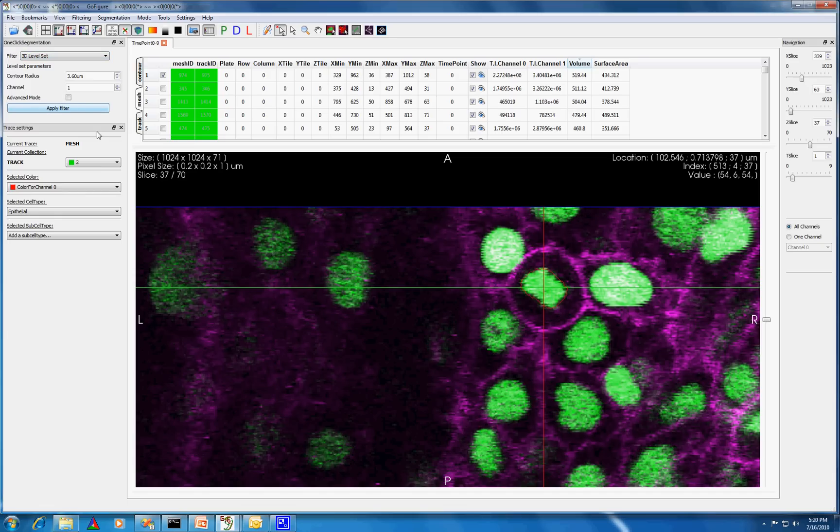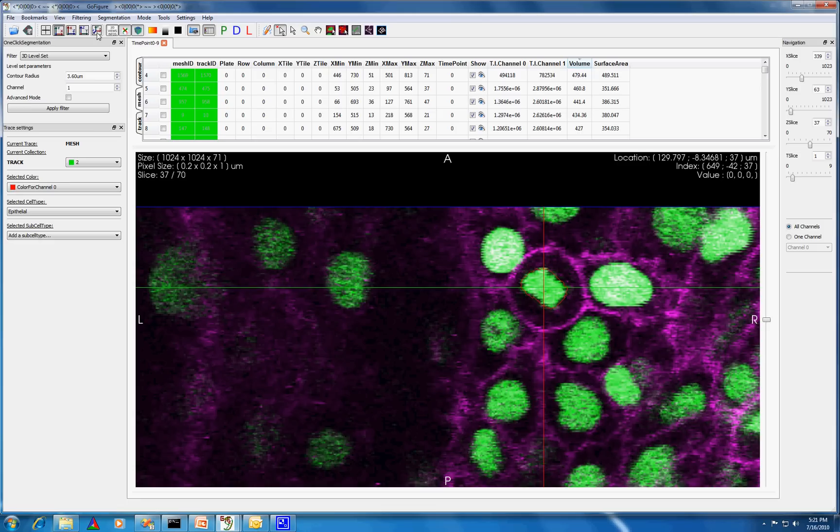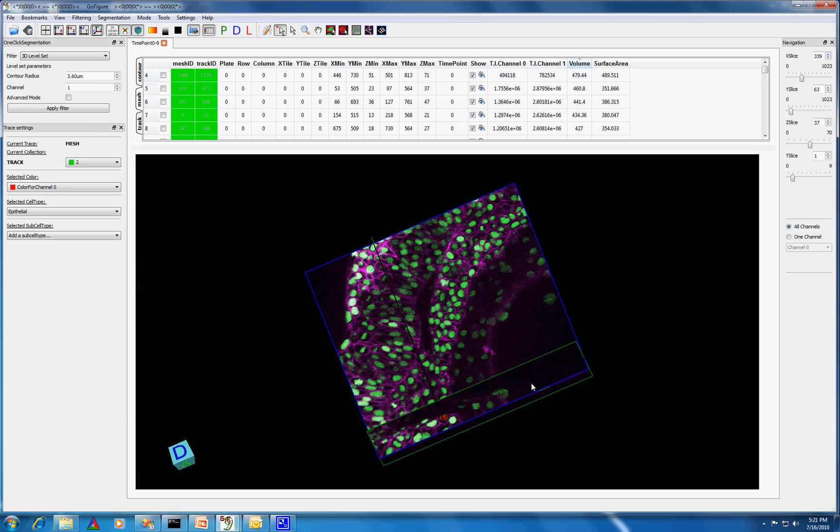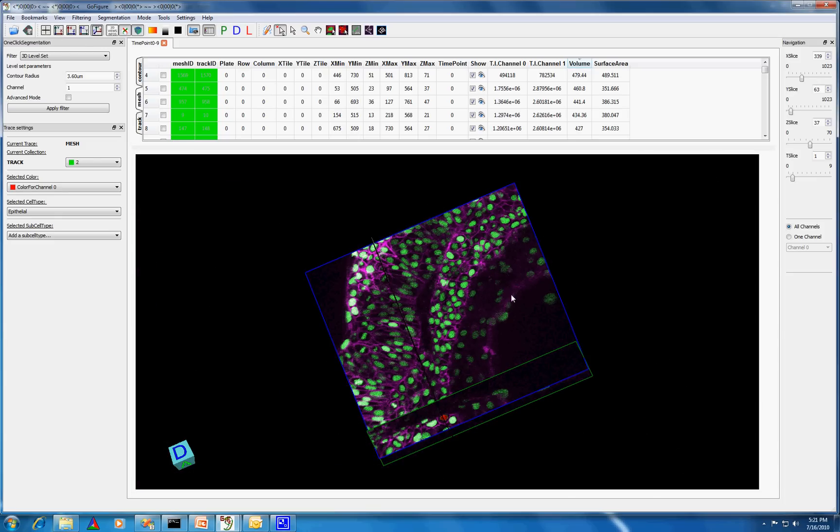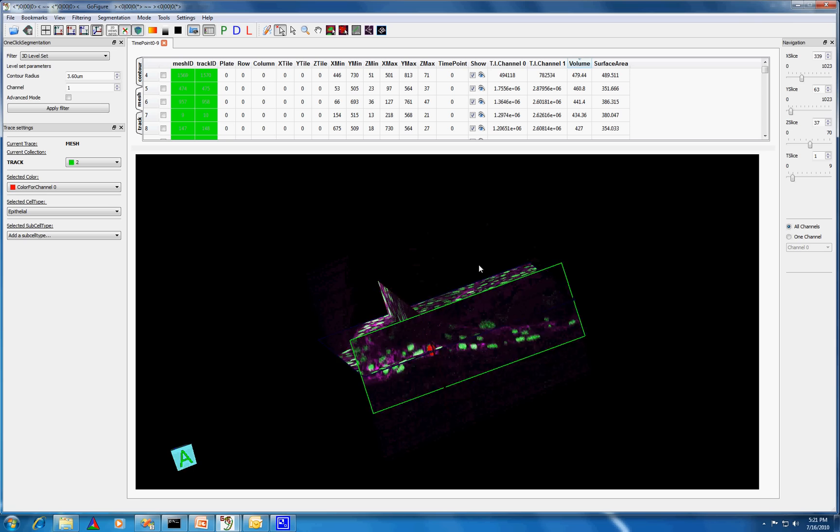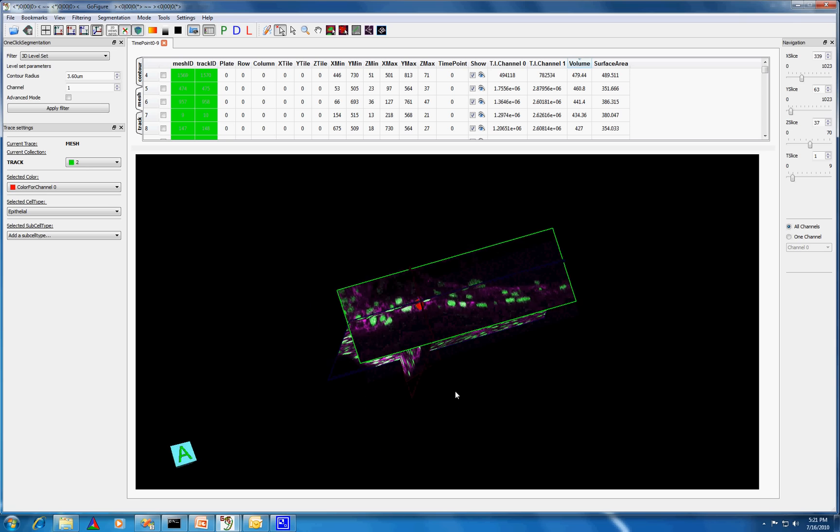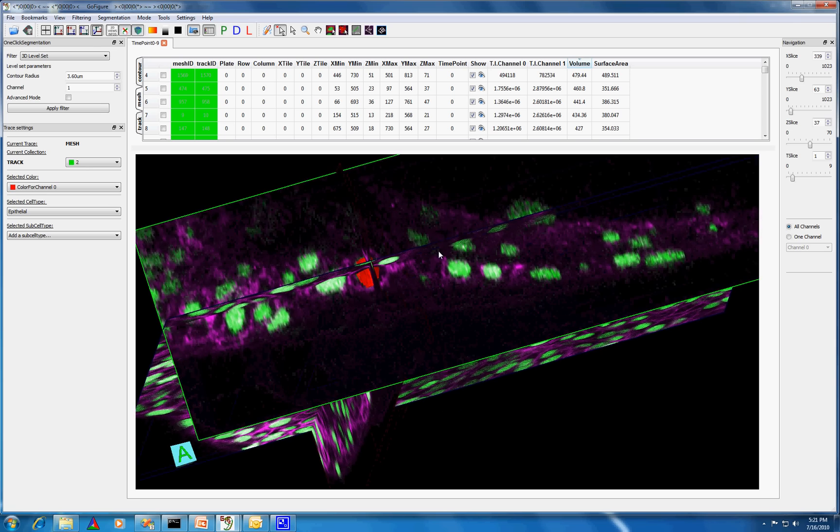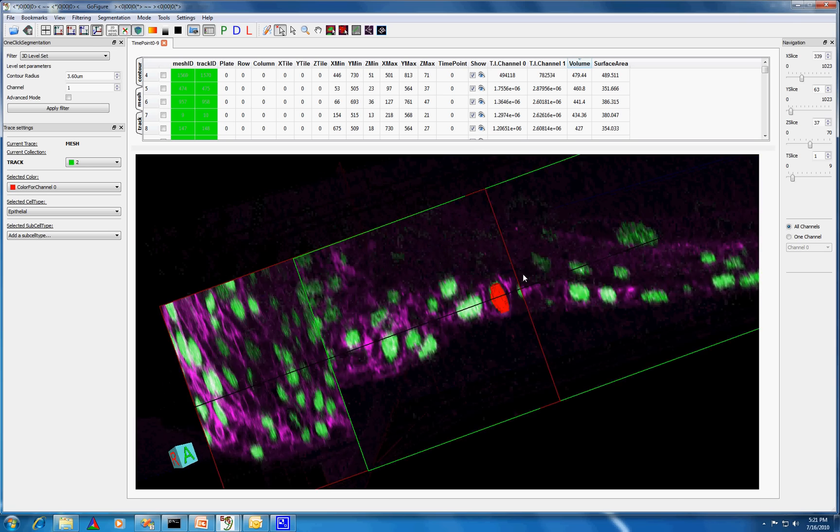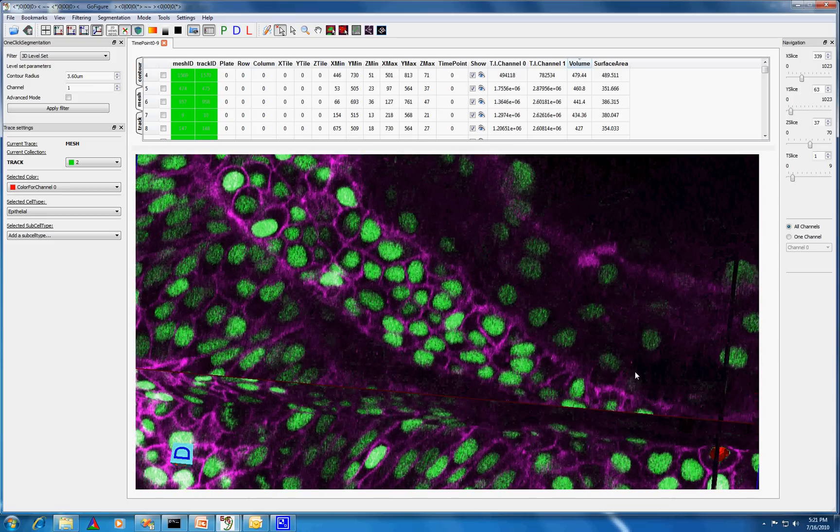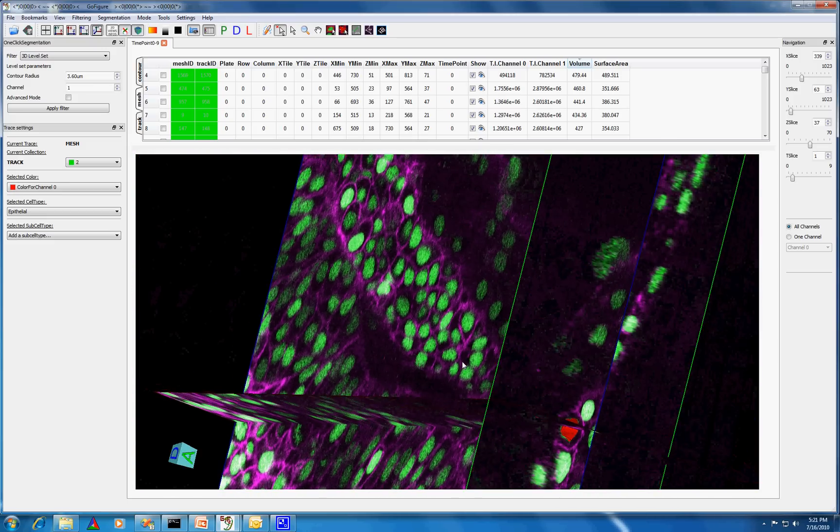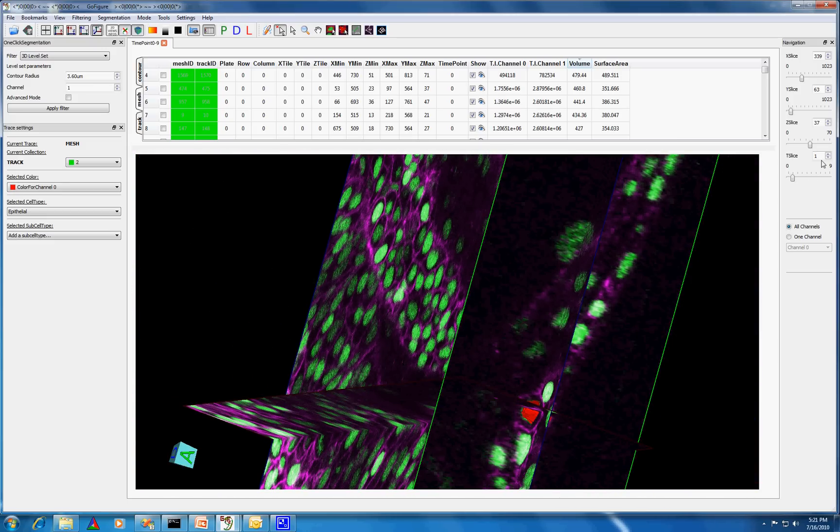We can see that this cell has been successfully segmented. Once this is done, I can go to the next time point to see what has happened to the cell.